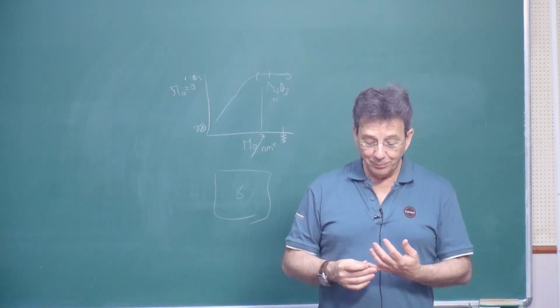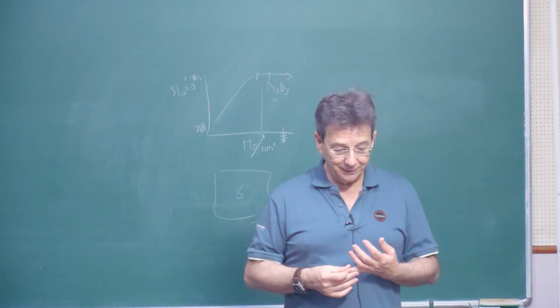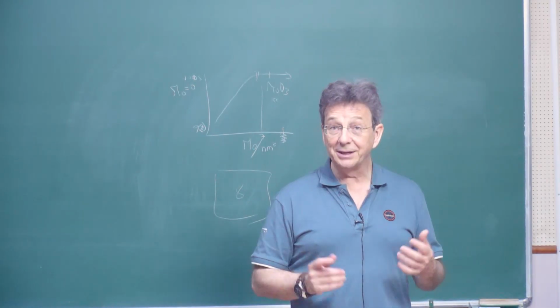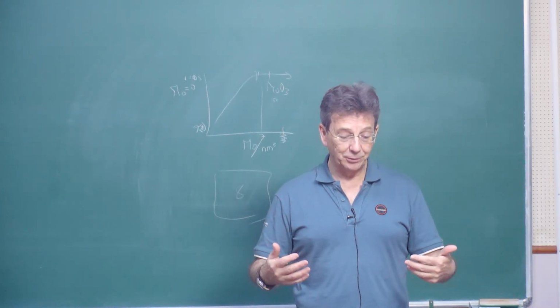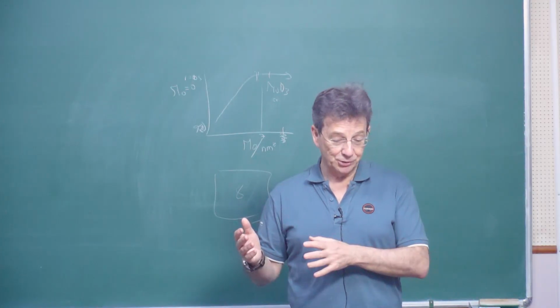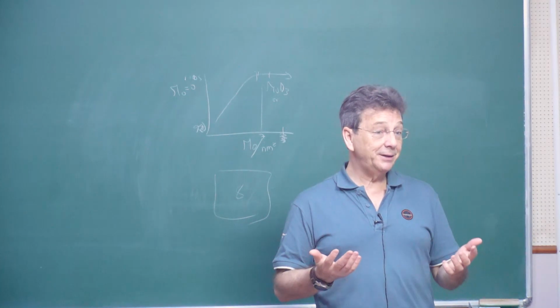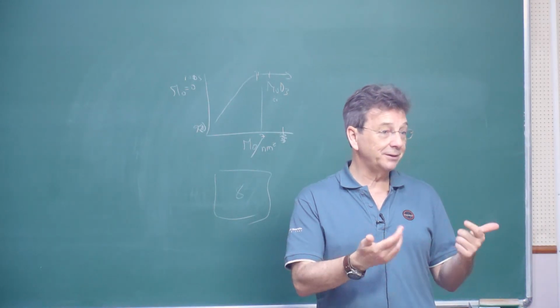These have not, at the moment of publication, been made for these dysprosium and terbium vanadates. So they know that the original phase, the one which is present up to 10 gigapascals, was the orthorhombic phase. But they keep on increasing the pressure, and they found that there was a phase 1, phase 2, phase 3, and phase 4 as you increase the pressure. So that's why you see these sudden changes, because you change a phase and then these vibrations are no longer present because it's a new structure with new characteristic vibrations.